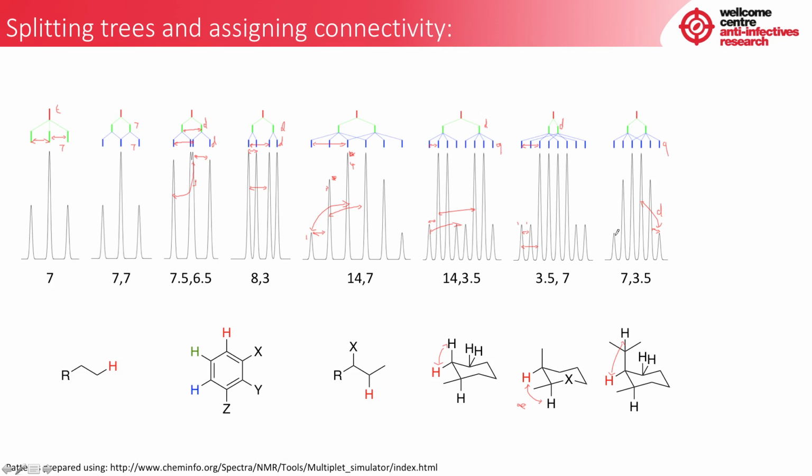And these signals can be distinguished, and you can distinguish these connectivity patterns from each other based on these signals. So we're getting really quite a lot of detail about how the atoms in our molecule are arranged with one another. There are limits. There are limits to what you're likely to be able to personally work out. I would suggest not bothering with this one, for example. There are also limitations that you should bear in mind when you take real spectral data. These are simulated, and so they work out perfectly.